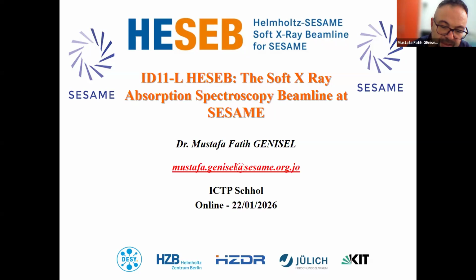But if you are asking about the elemental presence, less than 1%, it's getting lower and lower. I mean, the signals start to become noisy if your element is less than 1%.